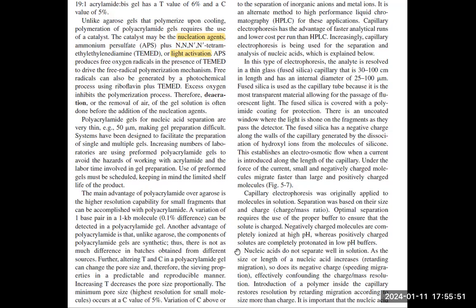Okay. And why is it that it offers a higher resolution capability over agarose? PAGE can detect a variation of as little as 0.1% difference. So a variation of one base pair in a 1 kb molecule can be detected in PAGE.